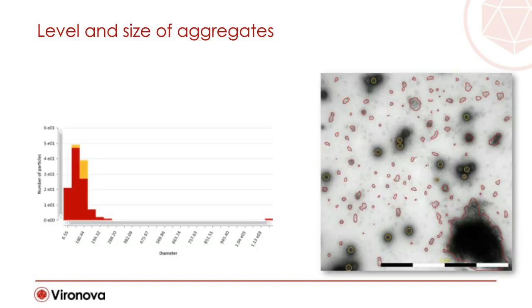The condensed statistical output can be used to quickly assess the sample composition. Deviating data can quickly be investigated using simple point and click on graphs, which will guide you to the right image for further evaluation. In this slide, we see, for instance, a deviating large registered object. Maybe, Josefina, you can elaborate a little bit about the possible causes and how this information can be interpreted.